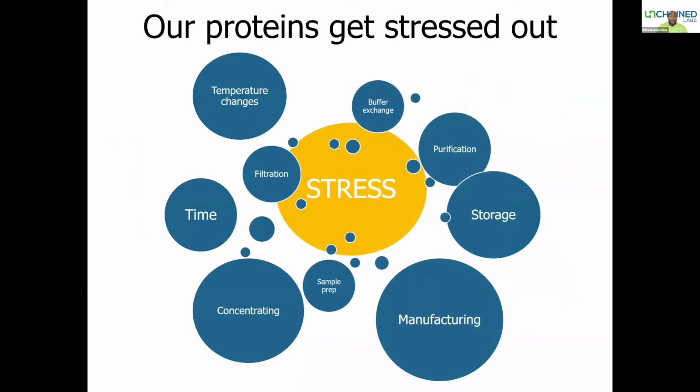So when you and I think about therapeutics, right, beyond the standard development, they're going to go through a number of steps to even become close to entering the market. And so you're going to have temperature fluctuations, different steps of purification. As we go through formulation development, we're going to buffer exchange them, for instance. And finally, as they move downstream, right, they are going to essentially also have to withstand the scalability process and being able to manufacture them. And in doing so, we're going to concentrate them, and that's a big part of the equation.